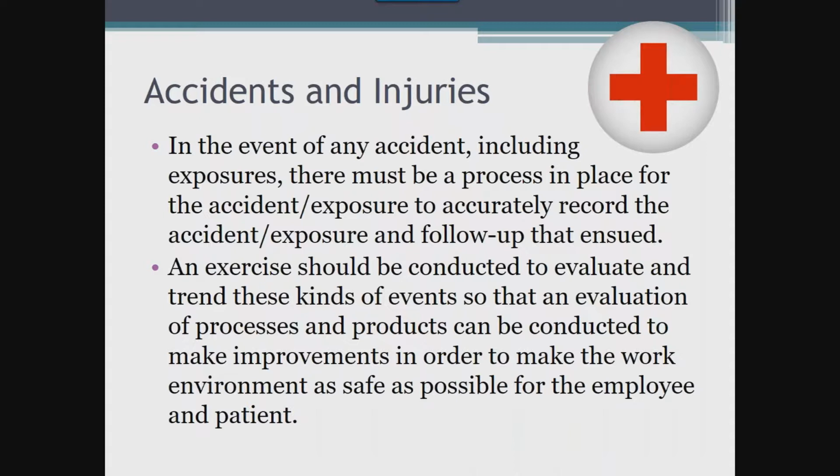I could go on, but the key point I want to make here is that all accidents and injuries should and must be reported. This is the only way leadership teams are able to identify when processes are broken and put focus on finding solutions or fixes to the situations that are occurring and causing employees to put themselves in a safety risk. Laboratories are required to record and trend accidents and injuries that occur.